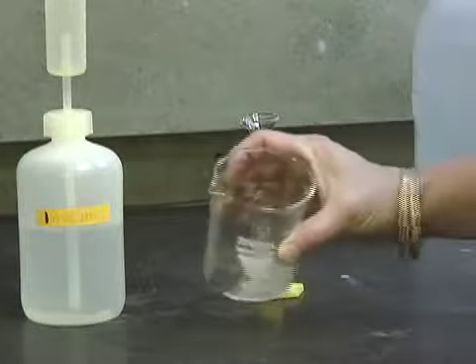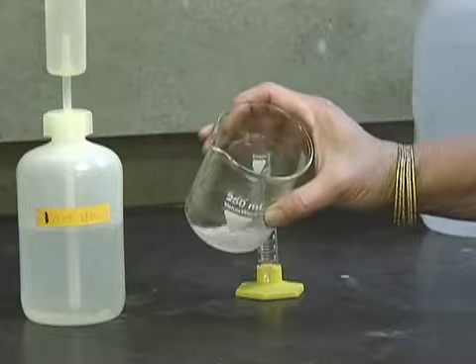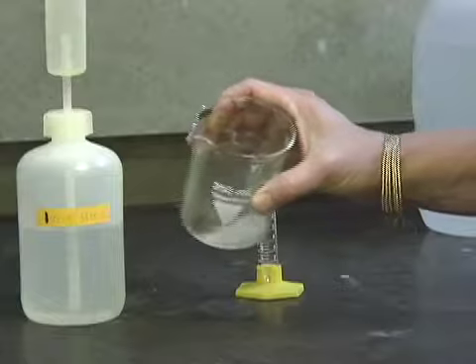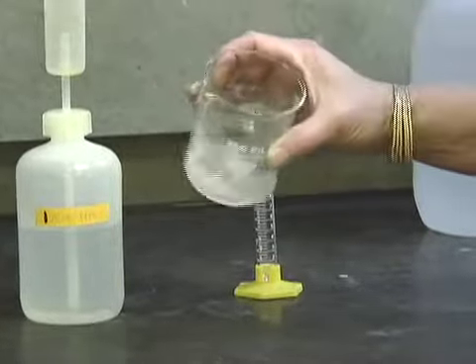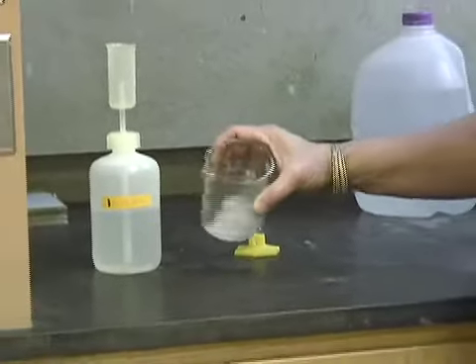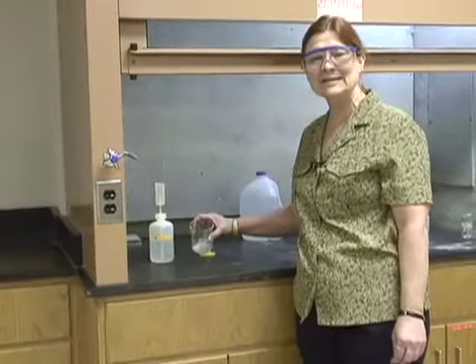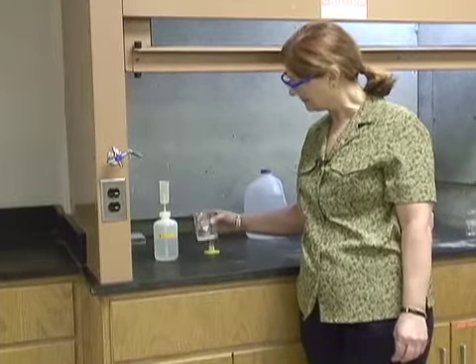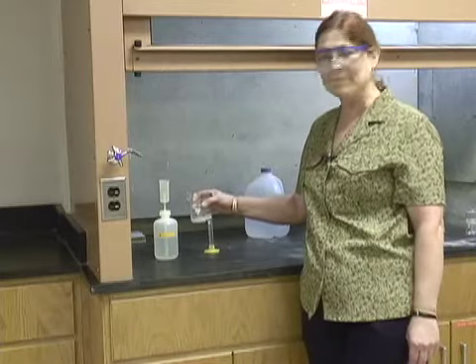So we have the magnesium dissolving into ions here, and we have the water reacting with it as well, as far as making it a solution. And all of those little pieces need to dissolve completely. And the gas that's coming off needs to go up and out.